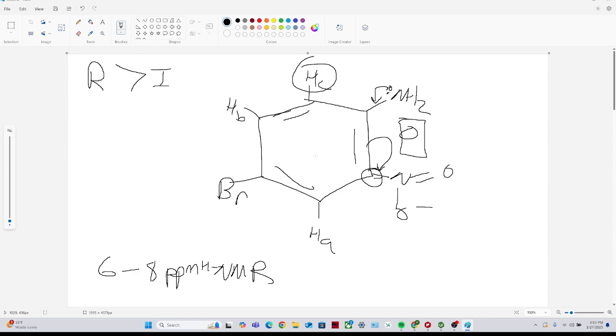And as a general rule of thumb, if you have an electron donating group by resonance, the positions it's going to impact are the ortho and para positions. If you recall from what makes a ring activated and what positions get activated for the regiochemistry, it's the ortho and para positions for this same reason, because you can have better delocalization of a charge here.